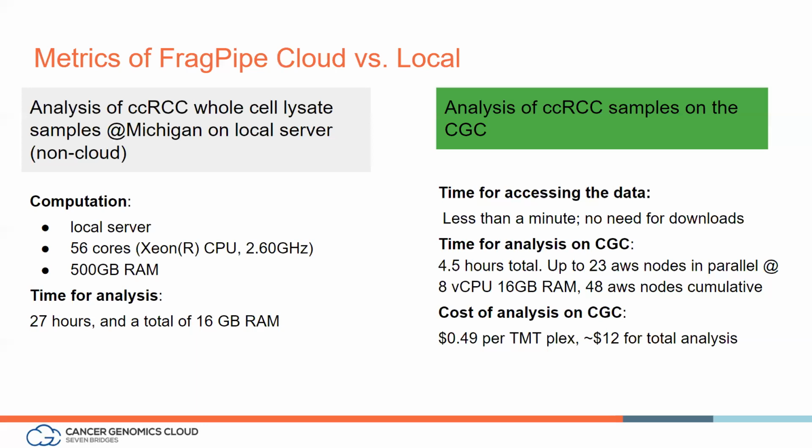The way the CGC workflows operate, and all the infrastructure behind them, are extremely tuned and designed to be extremely efficient for this kind of analysis, and can give you results much faster than a high performance computing device can.